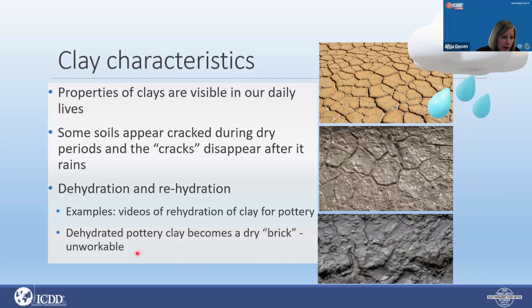The reason I have this example is that, if you're interested, you can take a look. There are a lot of examples online where you can see videos of rehydration of clay that's used for pottery, because it's shipped as a dry brick, a dry slab of clay, and artists will just put that in a bucket of water.